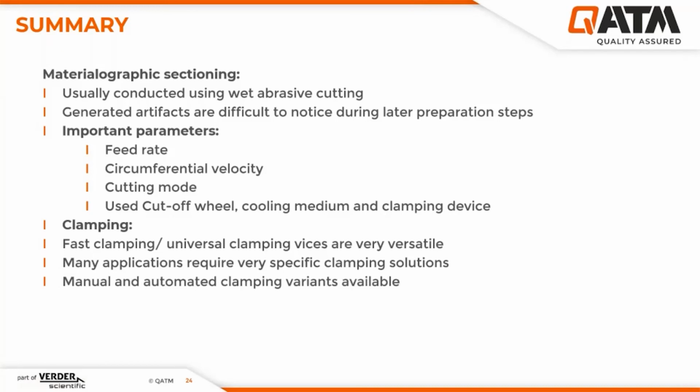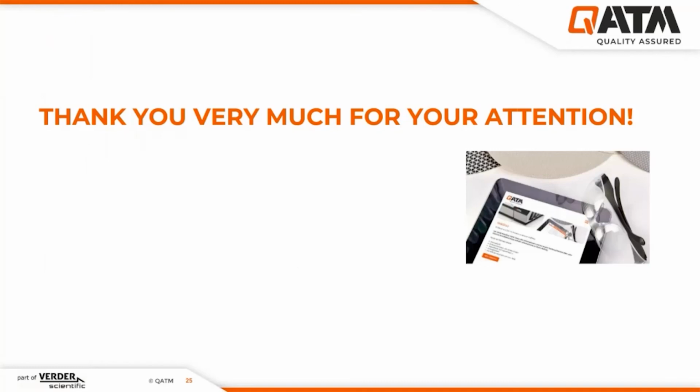There are also manual and automated clamping variants available on the market. And with this, I would like to thank you for your attention.